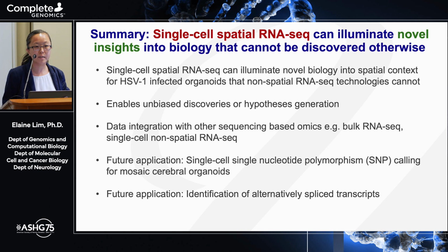The use of a sequencing-based platform was extremely important for us because we could then do data integration with other sequencing-based omics data sets that we generated in our lab, such as the bulk RNA sequencing or the single-cell non-spatial RNA sequencing data sets.